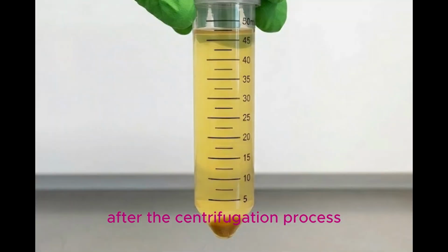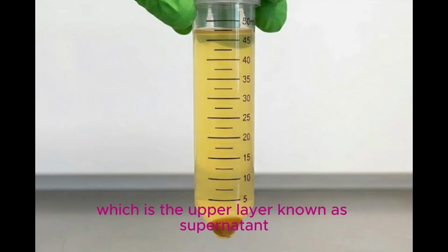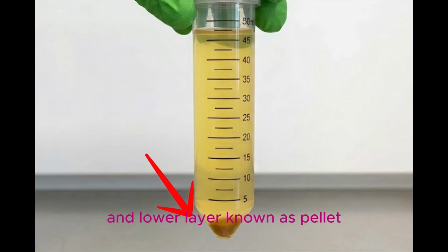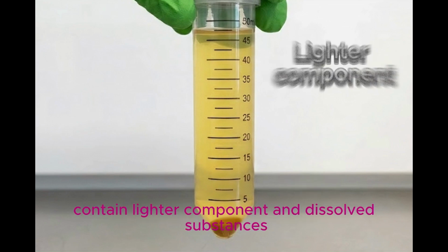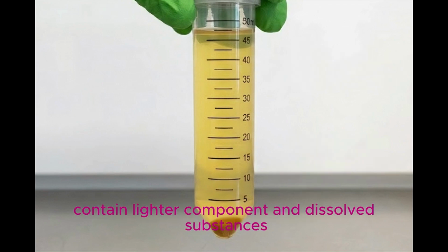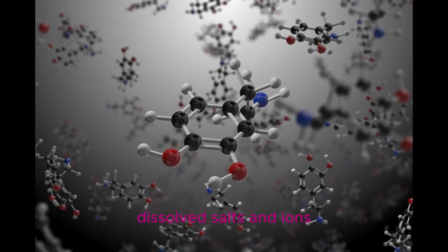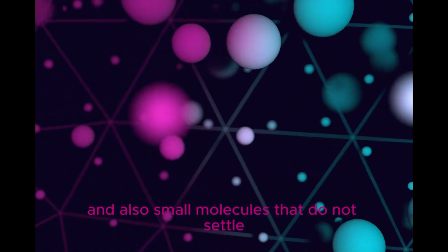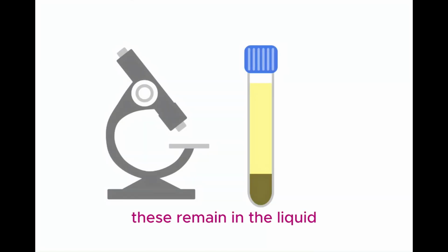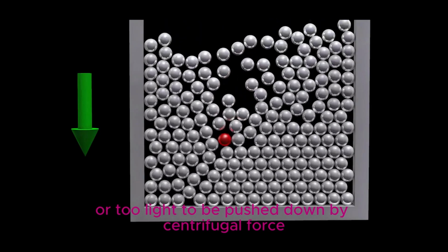After the centrifugation process, two distinct layers can be observed in the tube: the upper layer known as supernatant and the lower layer known as pellet. Supernatant contains lighter components and dissolved substances such as water, urea and creatinine, dissolved salts and ions, and also small molecules that do not settle. These remain in the liquid because they are too small or too light to be pushed down by centrifugal force.